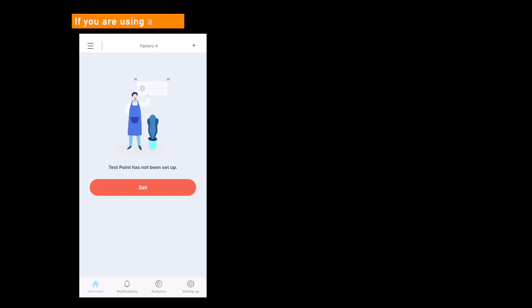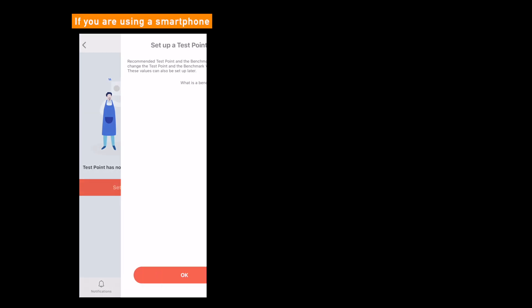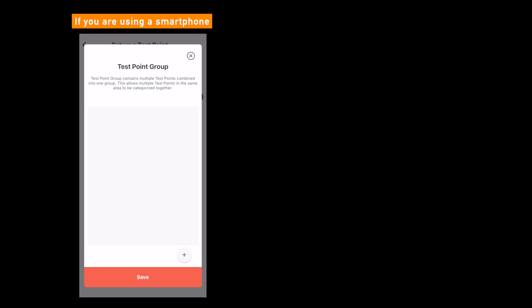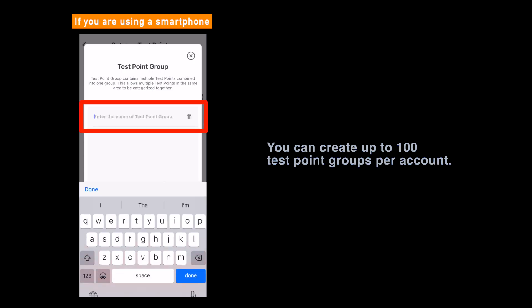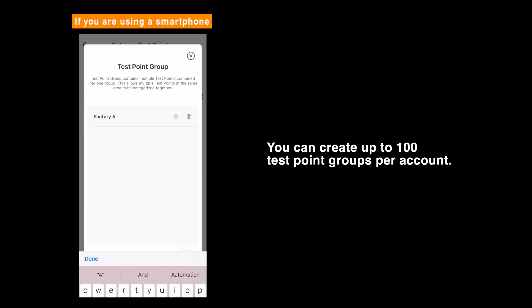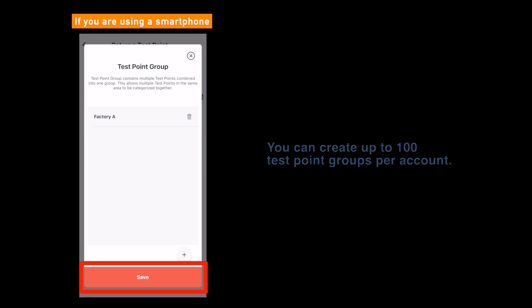Same when you are using a smartphone. Tap the set button. Then tap the test point group button. Tap the plus button in the bottom right, and enter a name of the test point group. At last, tap save.